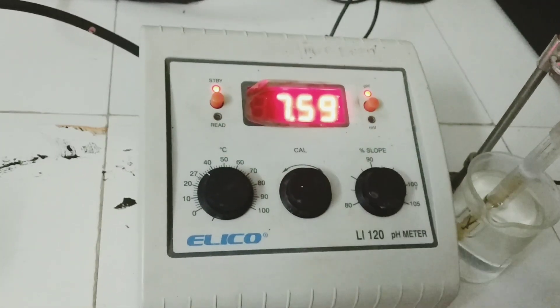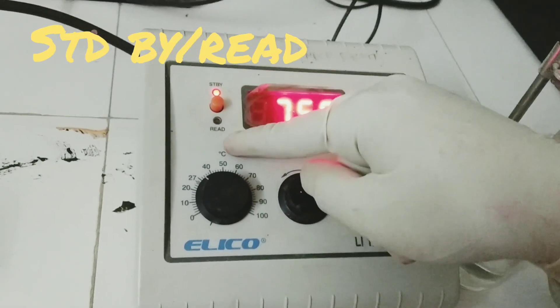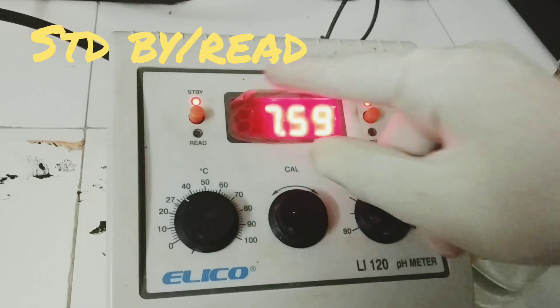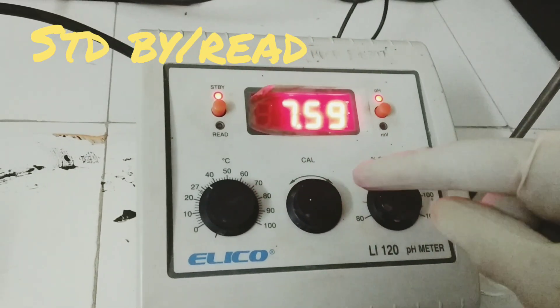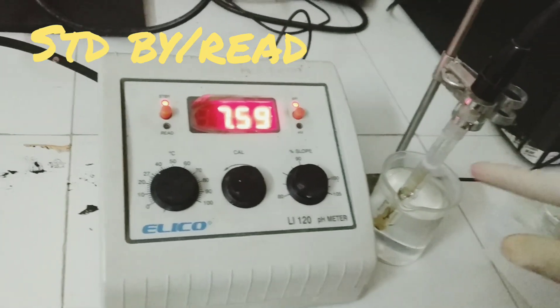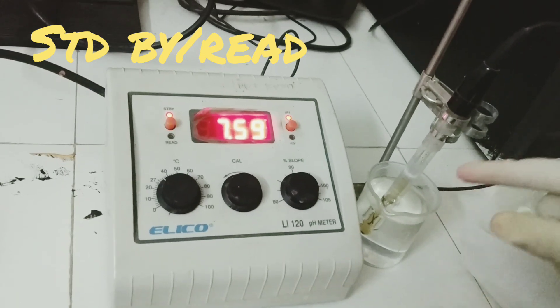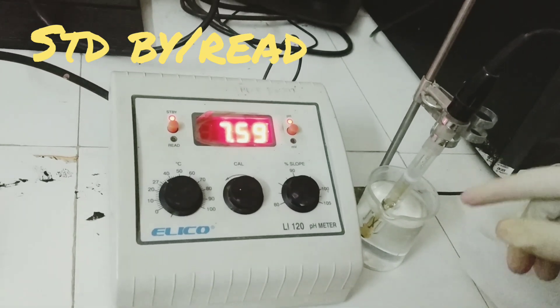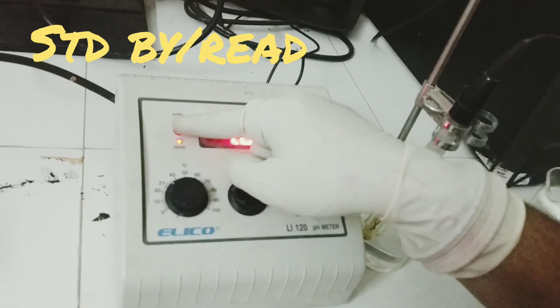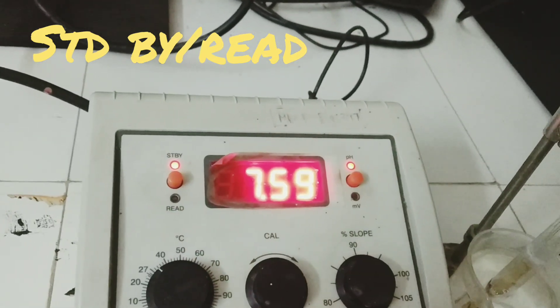On the left hand side, we have another push knob showing the standby mode and the read mode. The instrument is always kept in standby mode before taking actual measurements — that is, during changing of solutions or cleaning of the electrodes. When taking the actual measurement of a sample solution, we put it in the read mode by pushing the knob. Right now, we will be putting it in the standby mode.